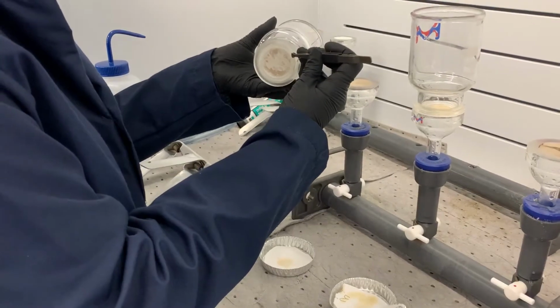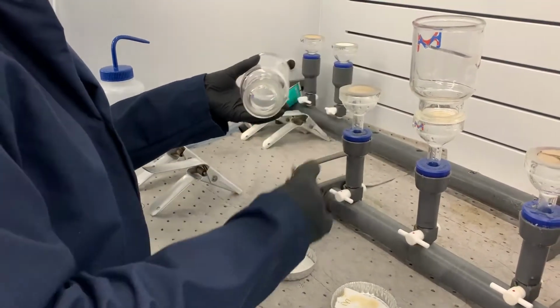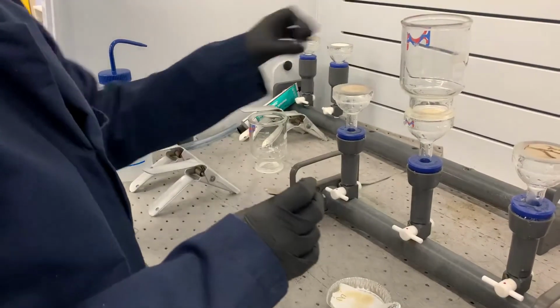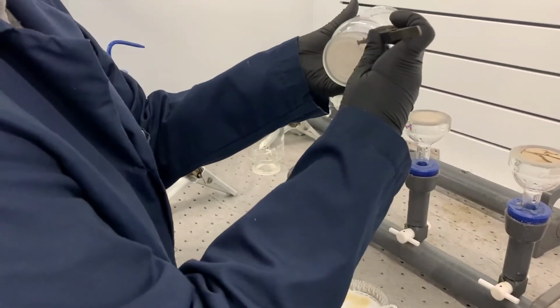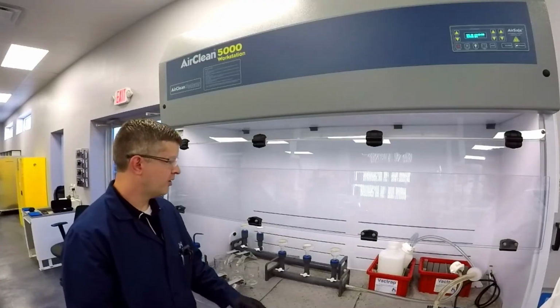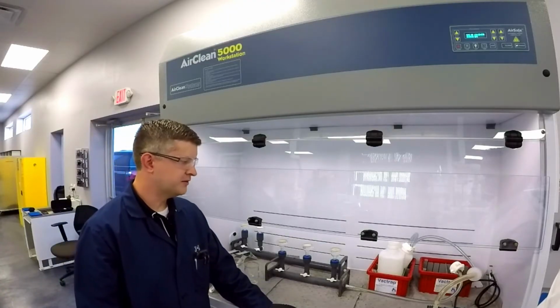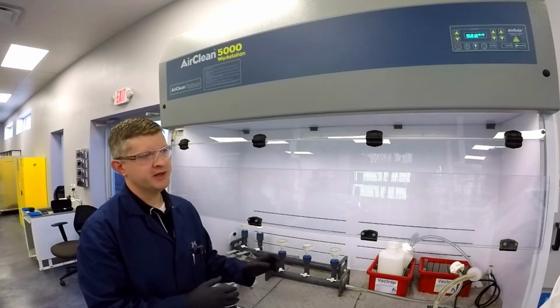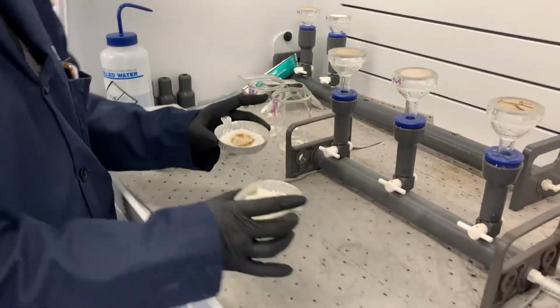So inside our system here, we have a 3-position manifold. We can run up to 6 if we use our second manifold, but 3 is sufficient for us here. And we do keep our solutions heated in a bead bath, so they're always warm, always ready to use. After all the different soaks take place, we are drying them inside our oven.